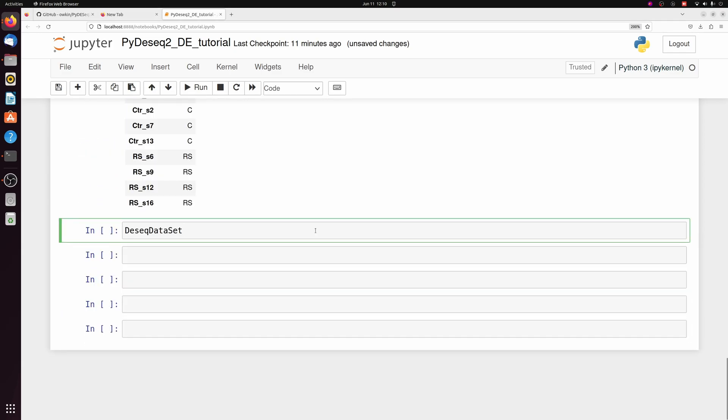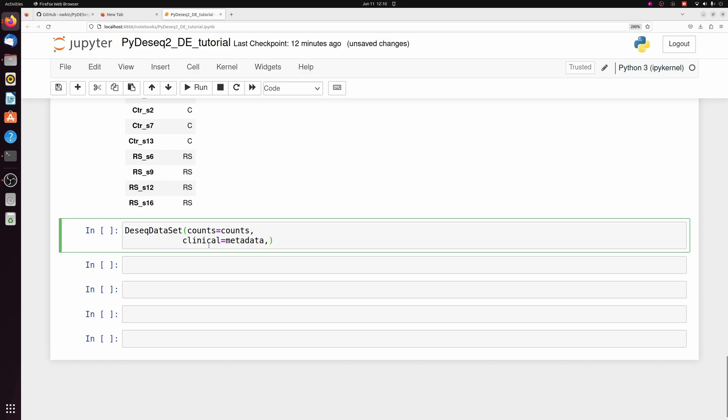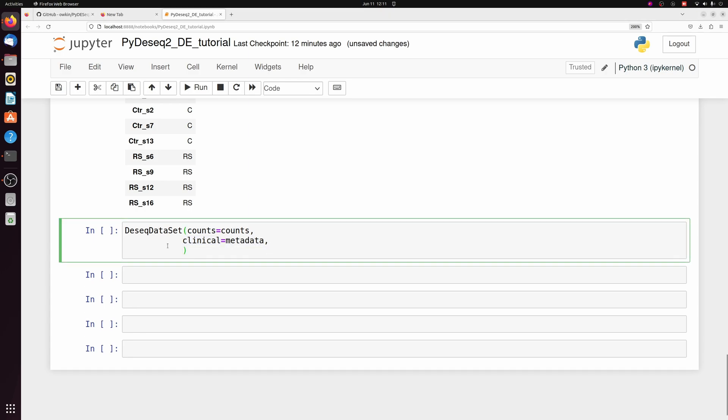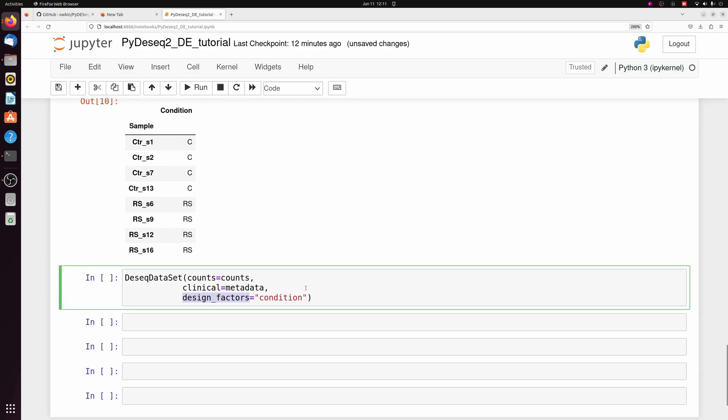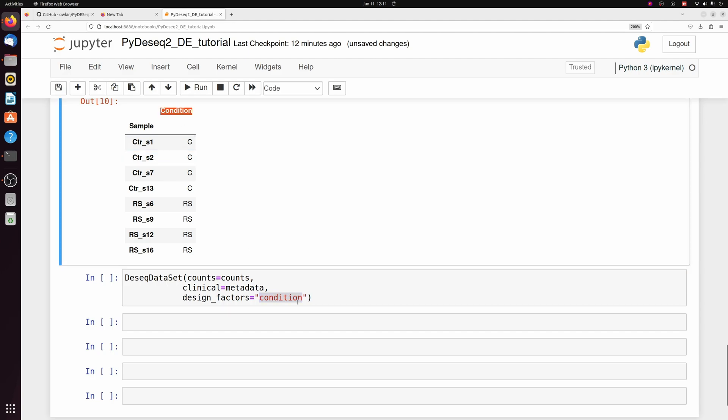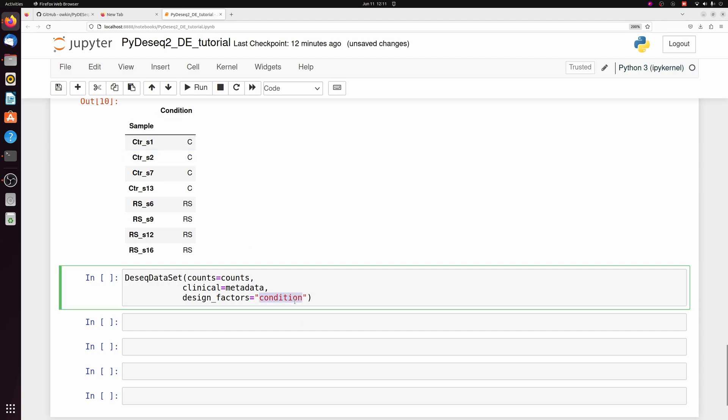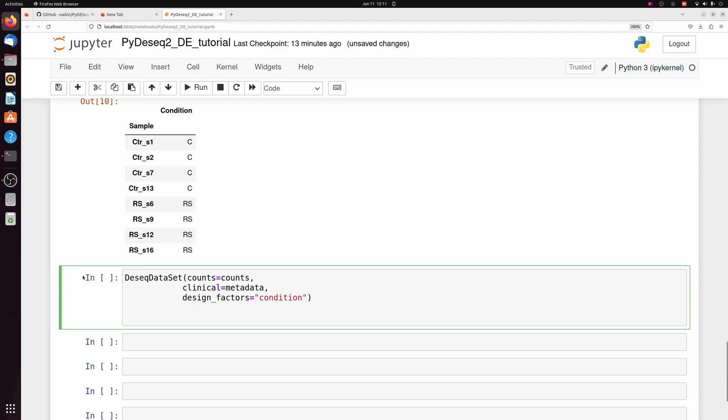We're going to use the dseqdataset function here to initialize our DDS object. We're going to specify that our counts object is that counts data frame we just made. We need to specify this clinical argument, which is going to be the metadata. And we need to specify the design factors or the formula for your differential expression. So we just have one variable condition here.